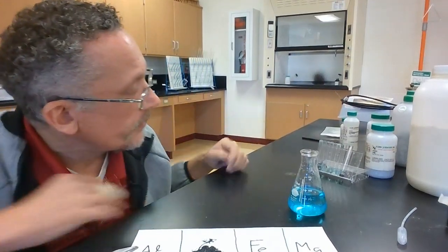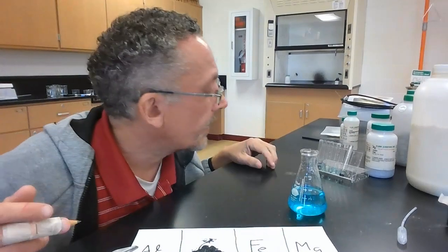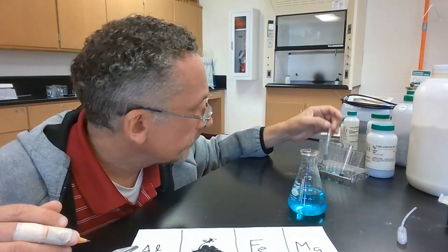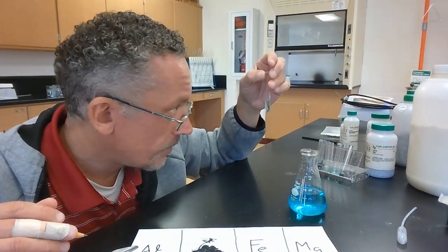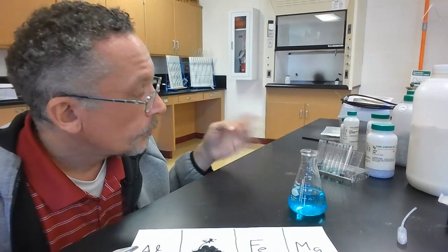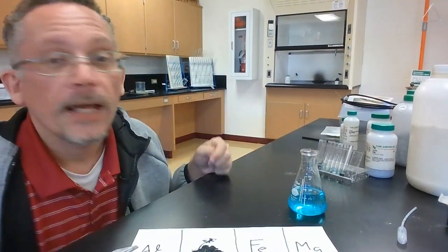Okay, so we can see a reaction happening with the aluminum. We can see definitely with the magnesium, and the zinc has already reacted. It's just totally black at this point. Maybe a little bit with the tin, and I don't see anything with the iron. So we have a reaction with the aluminum, with the magnesium, with the tin, and with the zinc. And the other ones have no reaction.